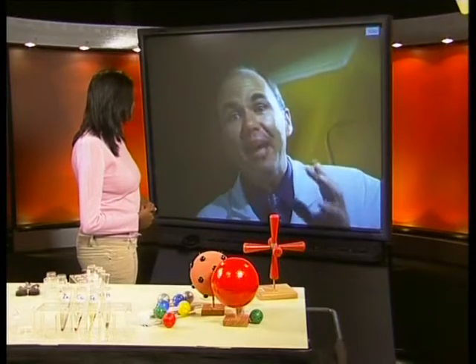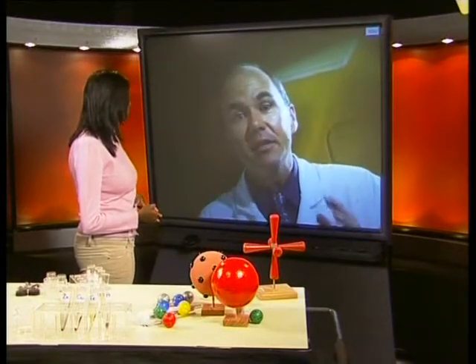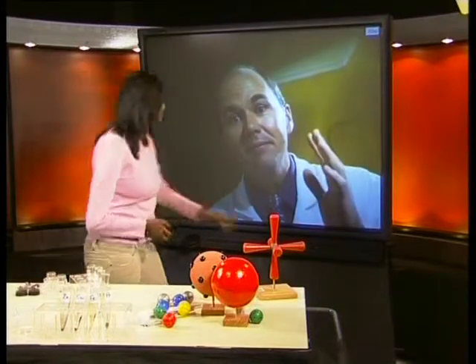I stopped you because I had an interesting idea. The reason that we're using nitrate salts is because they have a special property. They're all soluble. Sulfate salts, for example, wouldn't work. Lead sulfate is not soluble. It would give you bad results. So you have to use lead nitrate in these solutions. That's all I had to say. I'm sure your experiments will be ready by now. Bye.